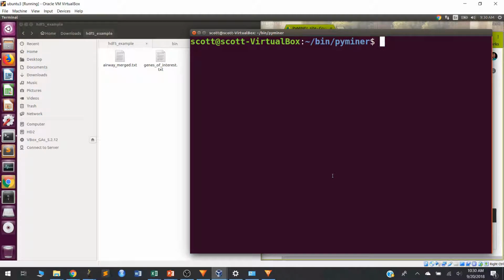Alright, once you've done that, I'll show you a little bit how to convert a typical input file, which is a tab delimited text file, as is the format of the file that you just downloaded, and convert that into a format which can handle data sets of unlimited size, or at least limited only by the size of your hard drive.